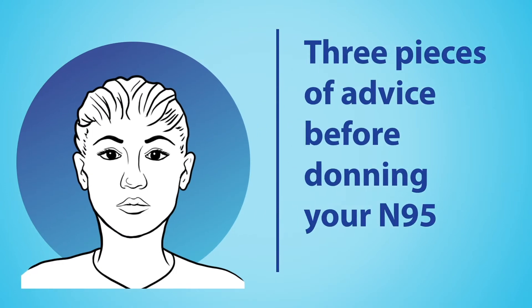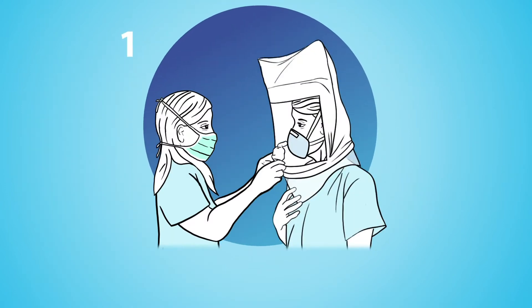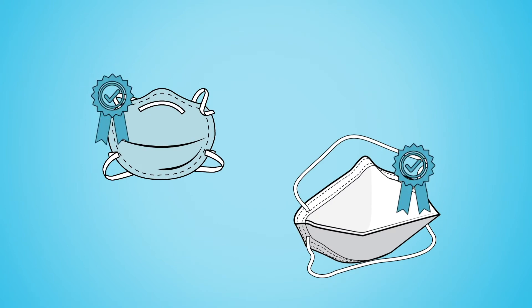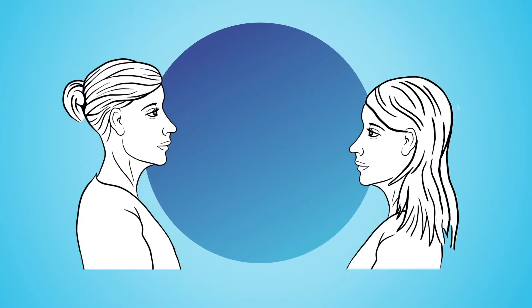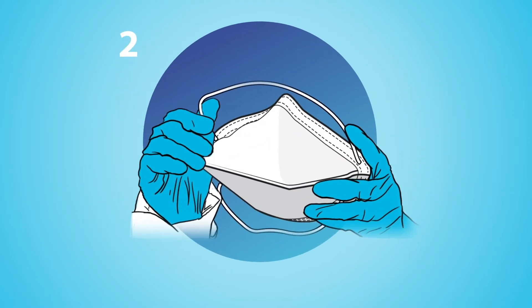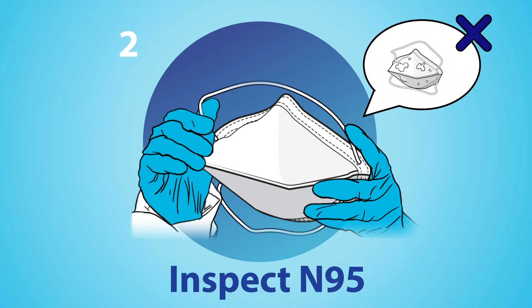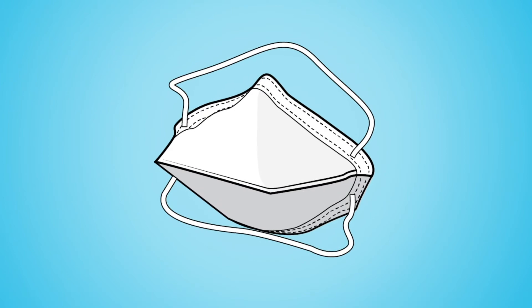Before you wear your N95, there are three things that you need to be sure of. One, before you wear it for the first time, check with your institution to see if a fit test is available. It is recommended to use a respirator that has passed the fit test. Using an N95 respirator with an exhalation valve is not recommended. Two, open the folds of your N95 fully and inspect the respirator to check for tears or damage, and request a new one if you find any.